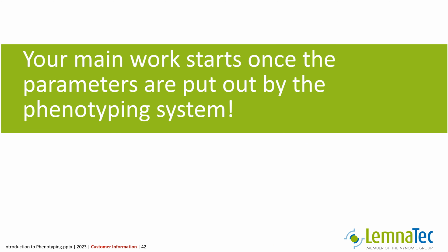The main work for the user starts once the parameters are put out by the phenotyping system, because this means the machine has done the job and now it's up to the user to interpret the data in the context of the biological questions that underlie the study.